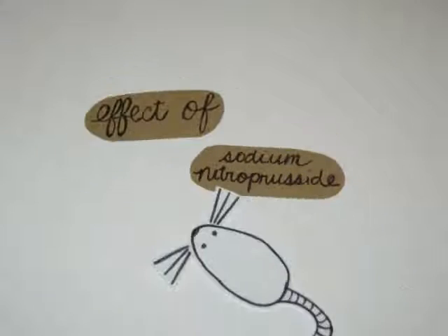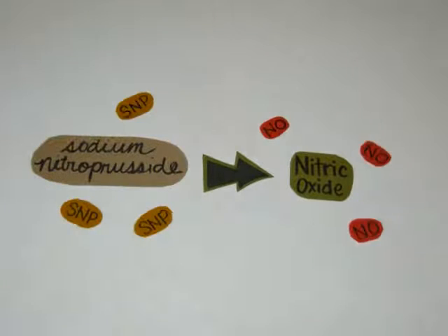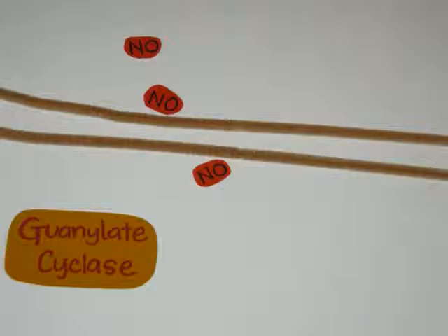Another control is taken and 2 milliliters of 10 millimolar sodium nitroprusside, or SNP, is applied to the uterus. SNP is a known vasodilator. When it is applied to the uterus, it breaks down to nitric oxide.